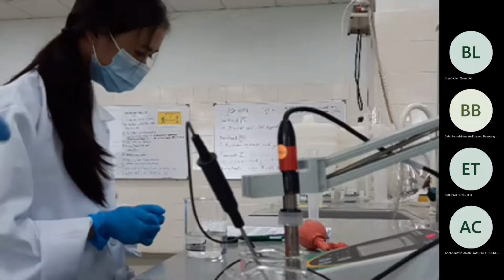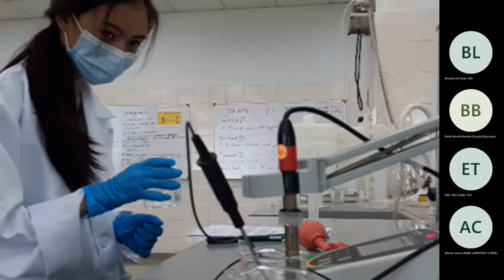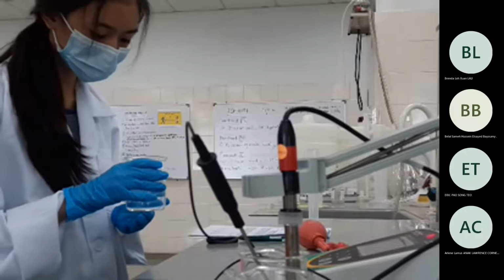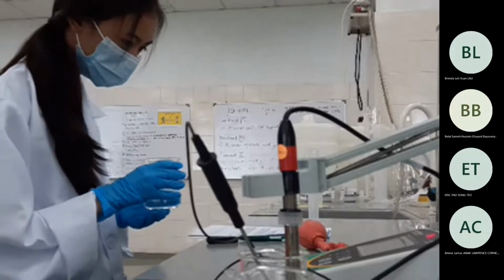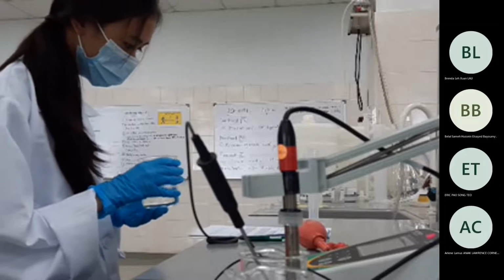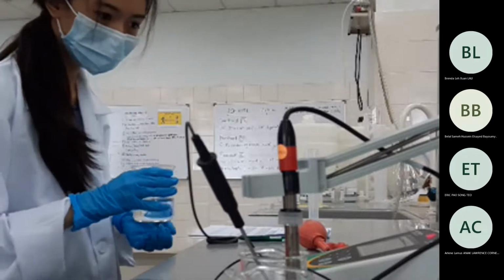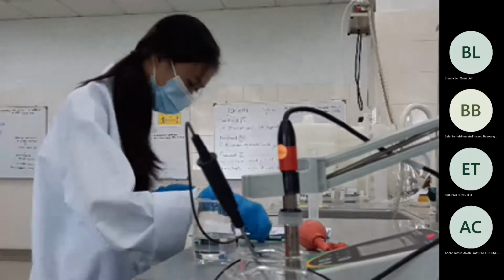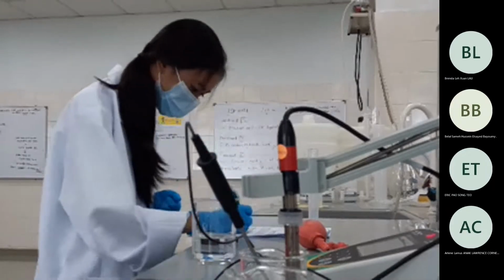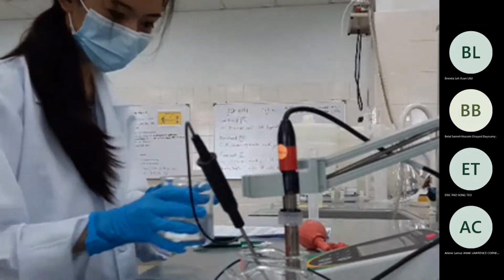It's acetic acid, yeah? Since we don't have much time, I think we can just take 4.40. This is reducing 0.01 after 2 seconds each time, so I think it will be ready soon.